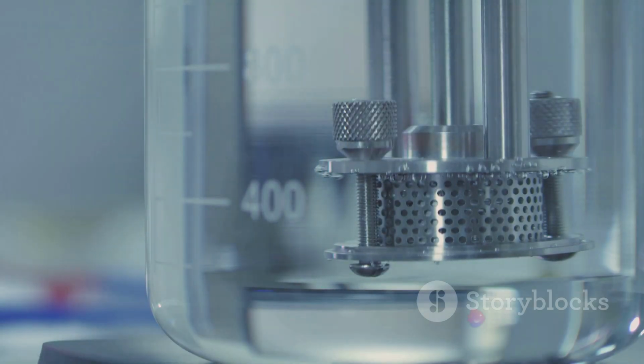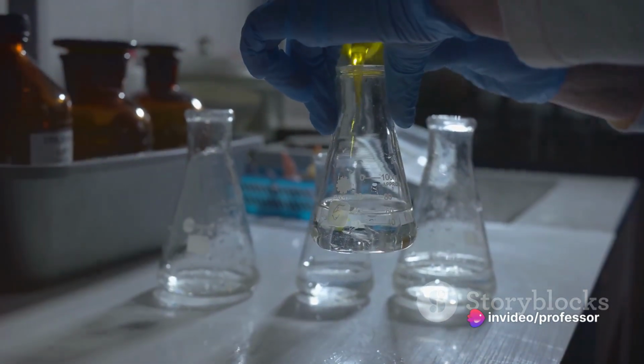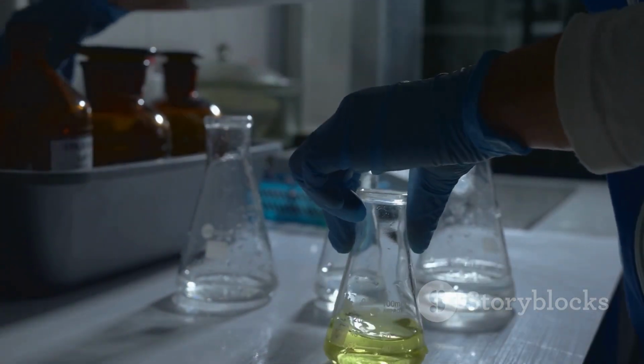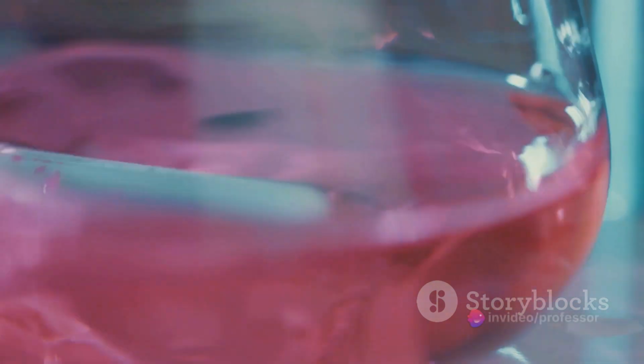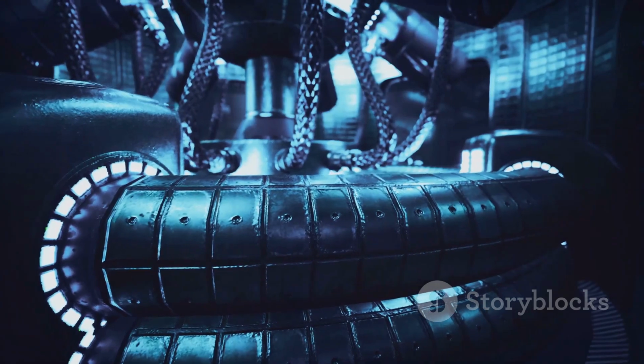Yes, it's true. In the world of conductometry, dilution plays a key role. When a solution is diluted, the number of ions per unit volume decreases, and so does the conductance. However, the decrease isn't linear. As we continue diluting, the conductance starts to decrease at a slower pace. This happens because the decrease in the number of ions is compensated by an increase in their mobility due to lesser interionic attractions. Now let's switch gears and talk about the cell constant. What is it, you ask?